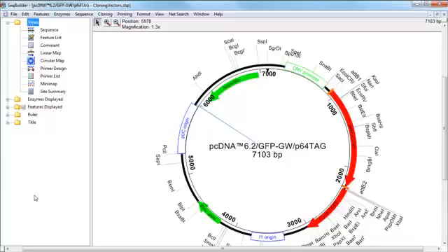And you can do that from directly within any of the graphical views, like the circular map, which is what I'm looking at now. So I'm going to show you a few different ways you can change the appearance of your map very easily.